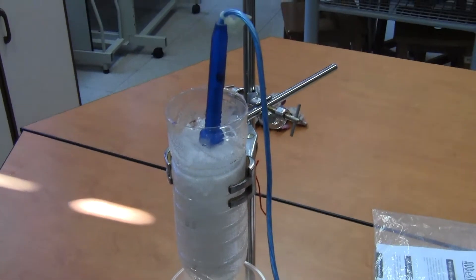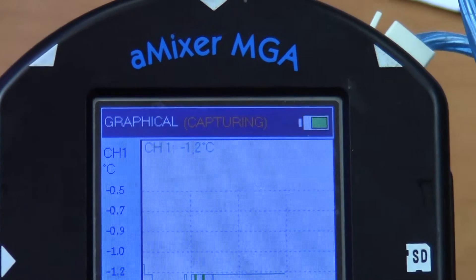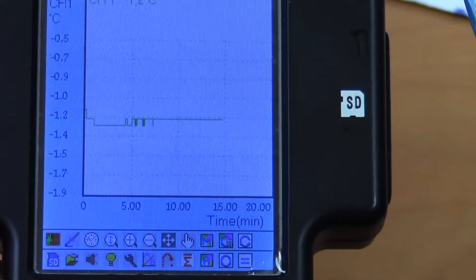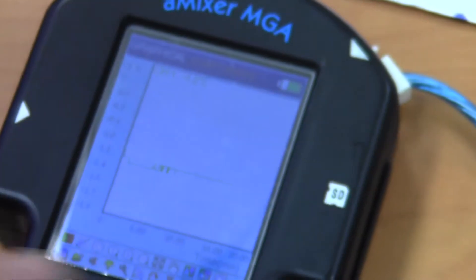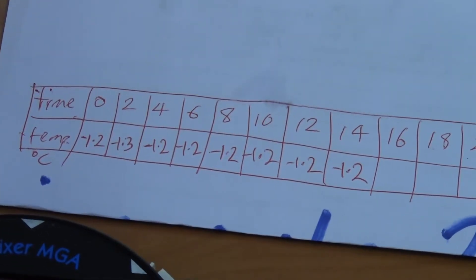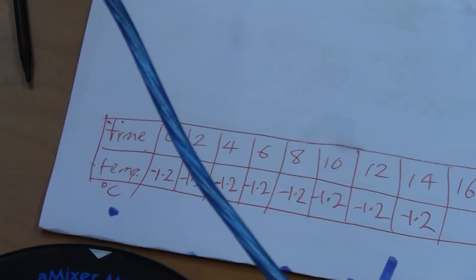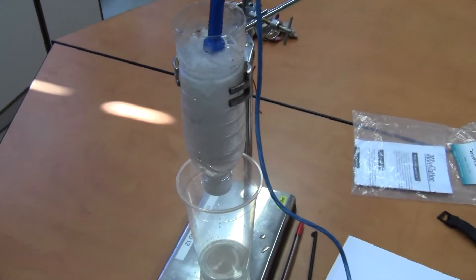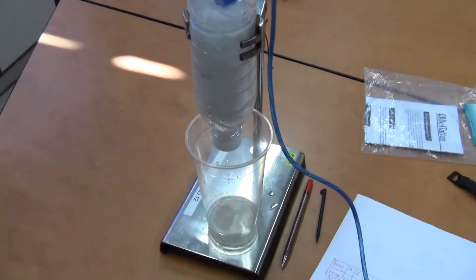The ice is slowly melting, and the temperature reading on the data logger is still minus 1.2 degrees Celsius — it's been that way all the time. It's now 15 minutes gone. Looking at my readings: minus 1.2, minus 1.3, and then minus 1.2 all the way. Now, you may ask why the temperature of the melting ice is minus 1.2 degrees Celsius, when the science textbook says that it should be 0 degrees Celsius.